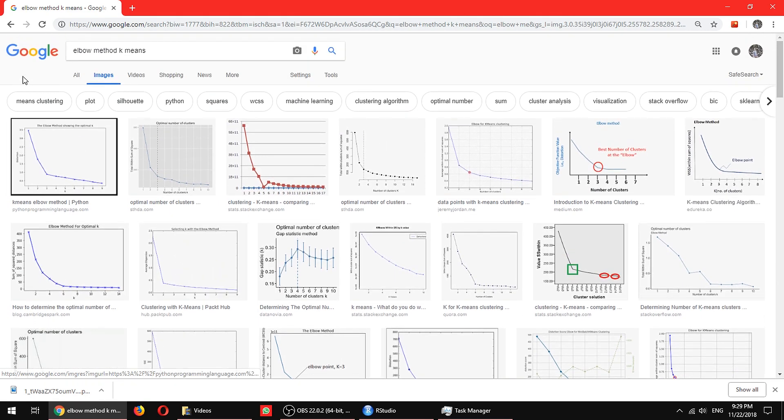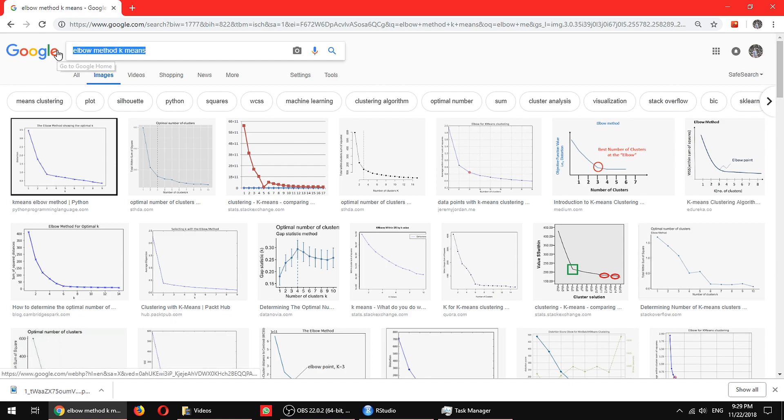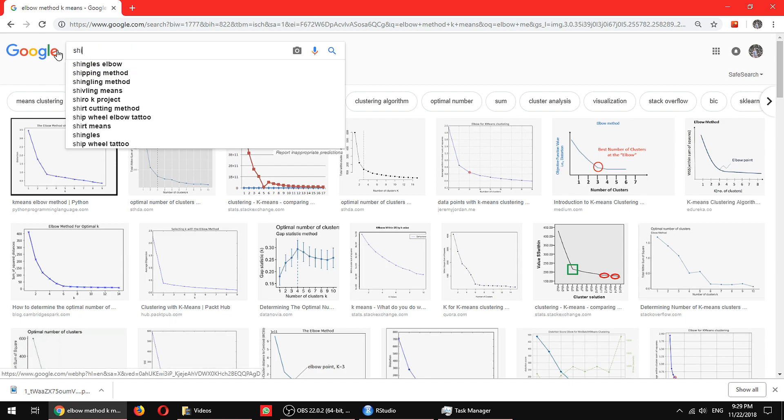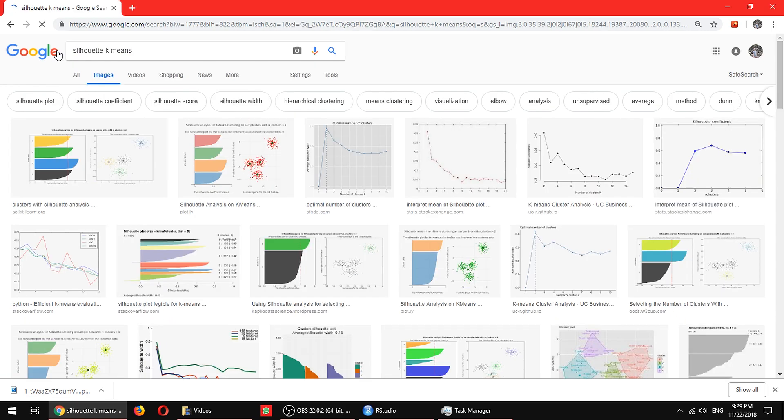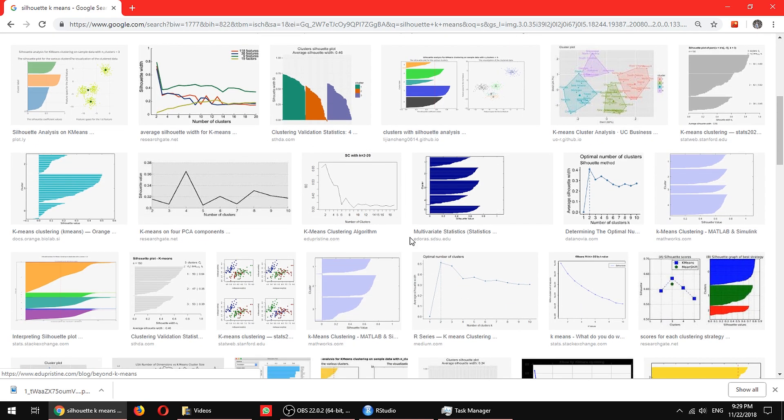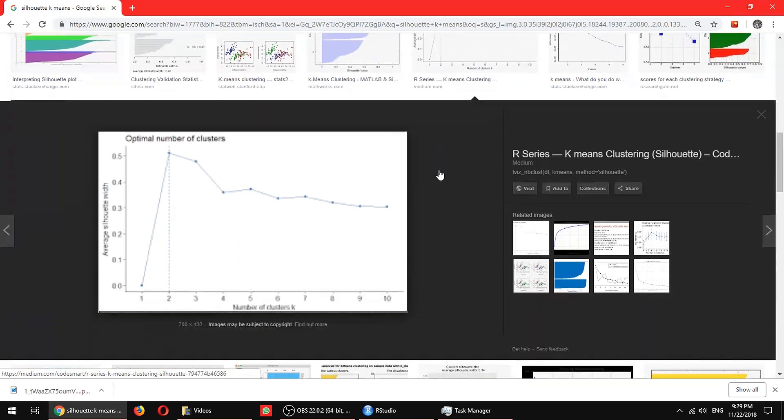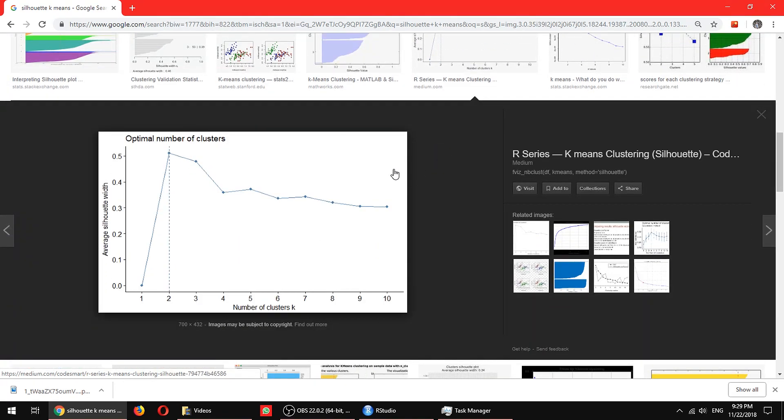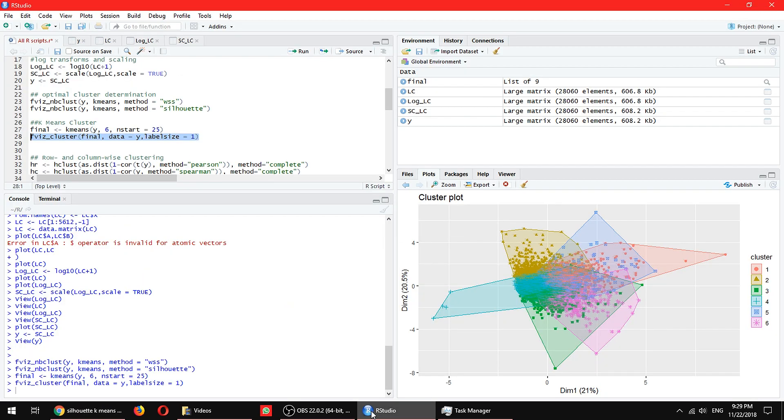The second one is actually called the silhouette method. On silhouette method where it would actually directly just tell you on the spot. Tell you directly on the plot where is the optimum number of clusters. So you don't have to worry about all that thing.